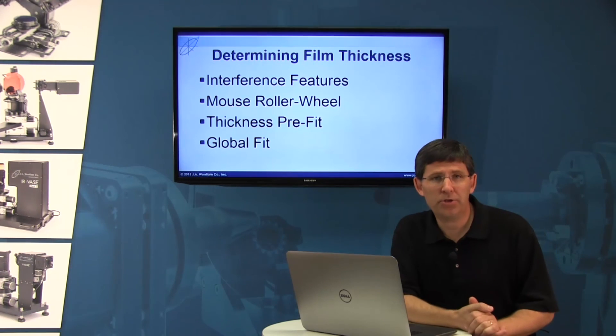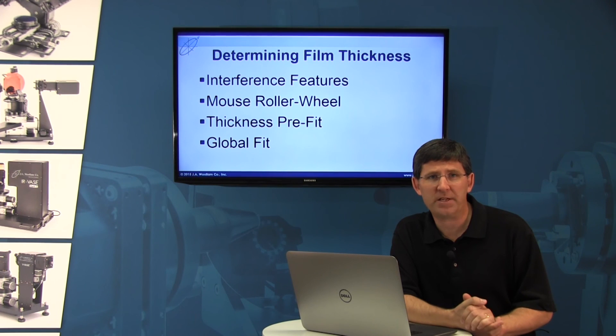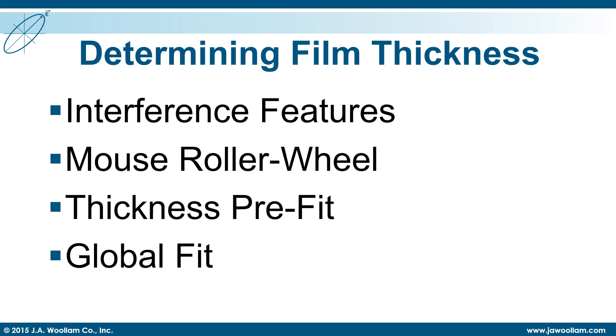So in conclusion, we've talked about interference features which you're going to see, basically peaks and valleys in your data anytime the film is transparent. We've talked about the mouse roller wheel function, the thickness pre-fit, and the global fit.